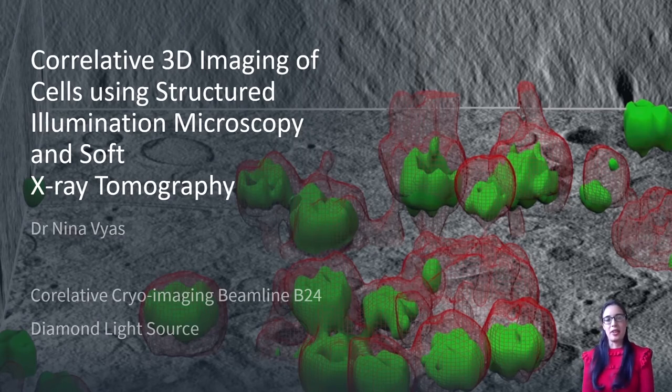Hello, I'm Nina Vyas, and I'm a postdoc at the B24 Beamline at Diamond Light Source. Here we have two techniques for imaging biological samples, cryo soft X-ray tomography and cryo structured illumination microscopy. In this talk, I'll focus on a protocol we've developed for effectively correlating datasets from these two modalities.